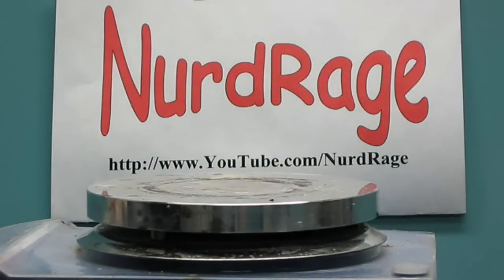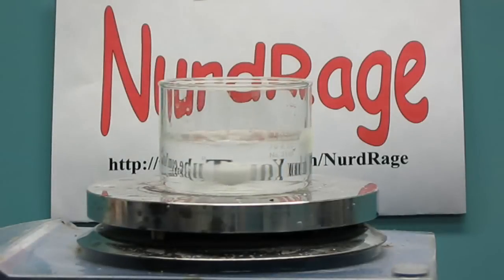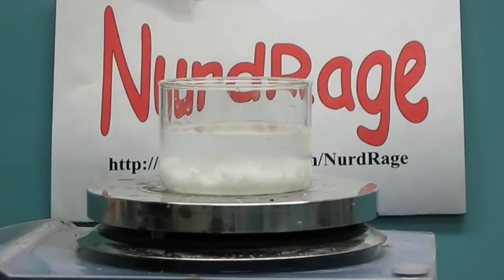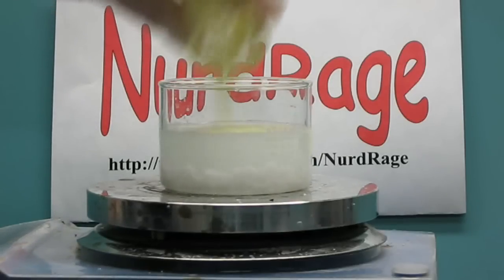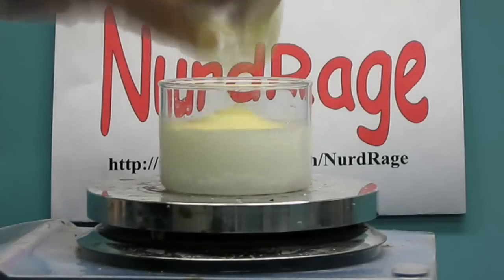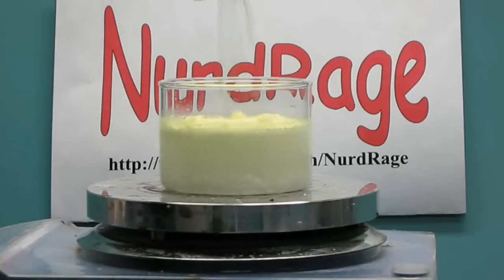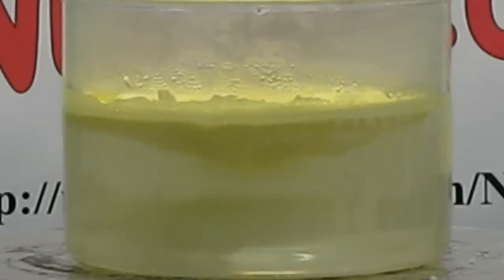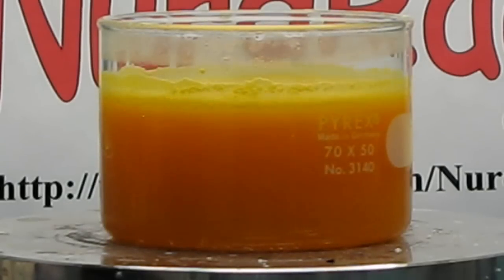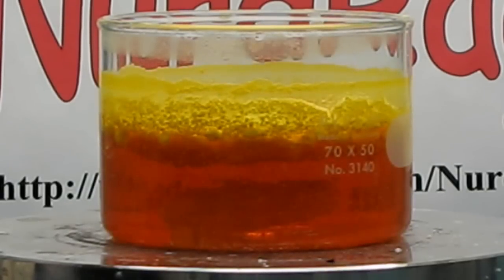First, we need to make the anodizing solution. We start with about half a cup of water and add 2 tablespoons of sodium hydroxide and 1 tablespoon of sulfur. Both of these chemicals are easily bought online. Then we stir for about 10 minutes, which will time lapse for this video. At the end we get this orange solution of sulfur and sodium hydroxide, which is highly corrosive so always wear gloves when working with it.